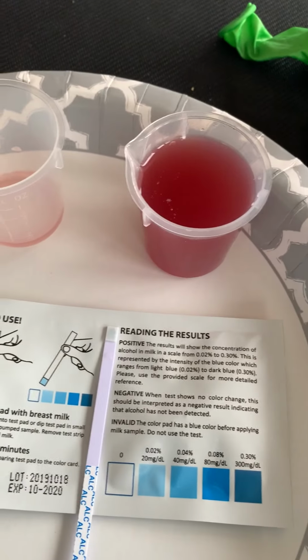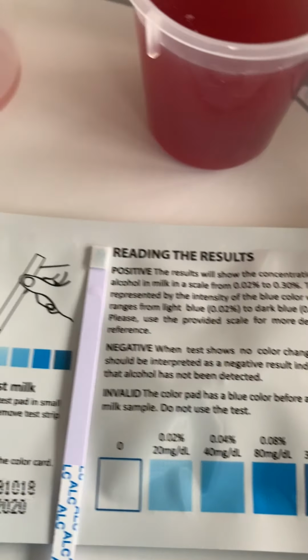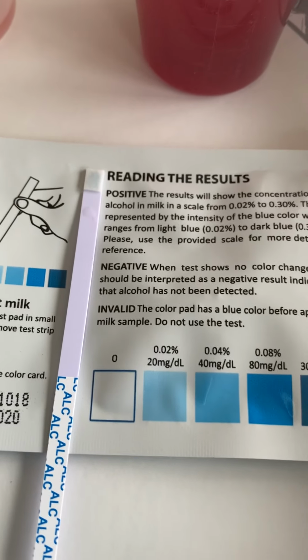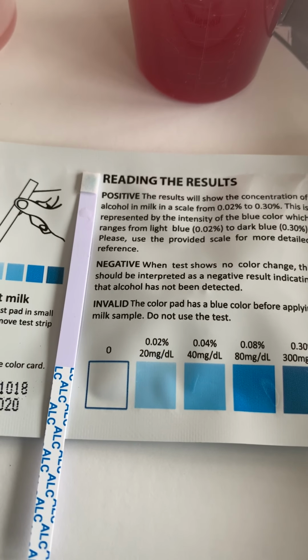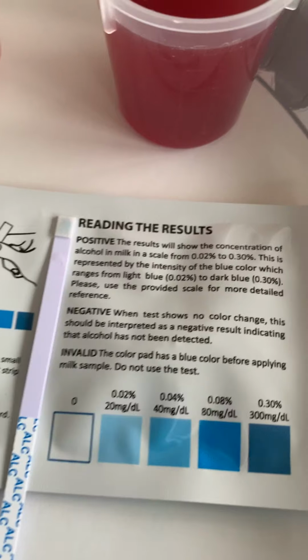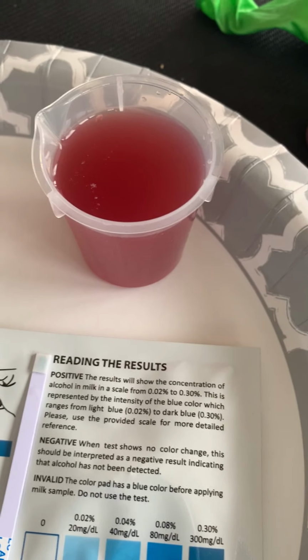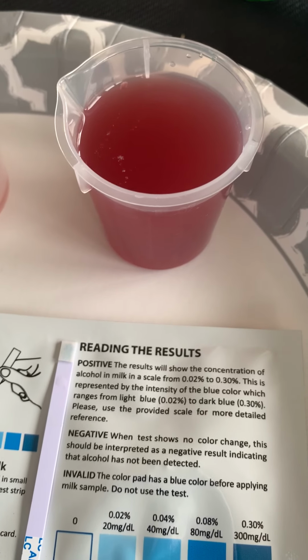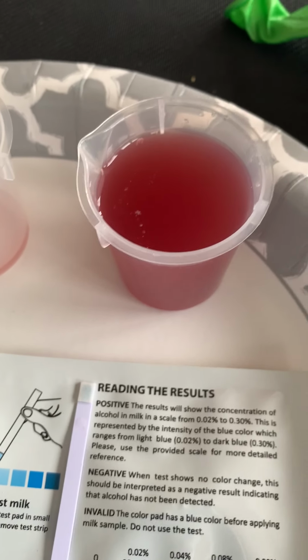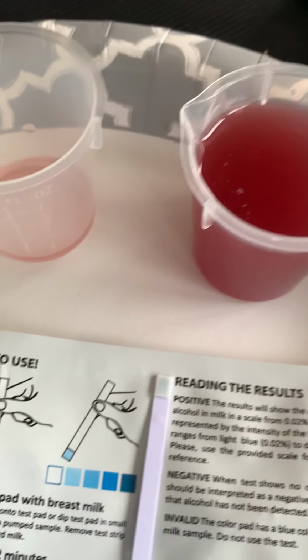And actually it works quite well. It's very sensitive to alcohol detection. You can see that the tip of this test strip indicates that there is alcohol present between 20 mg per deciliter and 40 mg per deciliter in that topmost fluid. The stuff that was mostly, I mean, it wasn't completely transparent, but it was definitely more translucent and transparent relative to that collected aggregate at the bottom of the test tube.